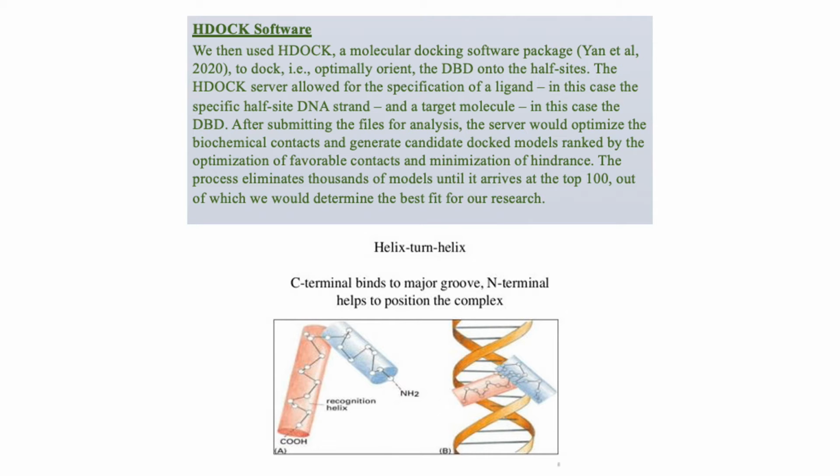For docking the DNA half sites to the DBD, we used the HDock software program. This program tests many different orientations of the DNA-DBD binding and scores the top 100 docks, with a more negative docking score representing a more favorable dock.